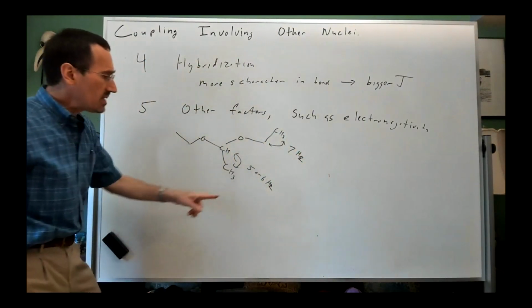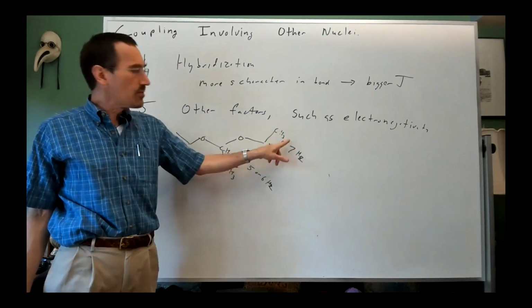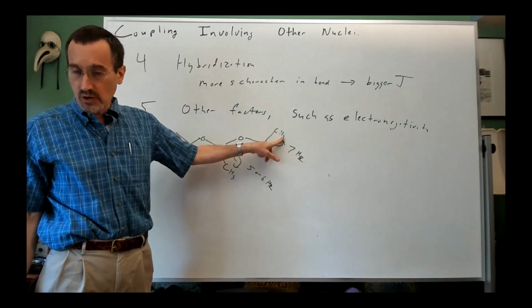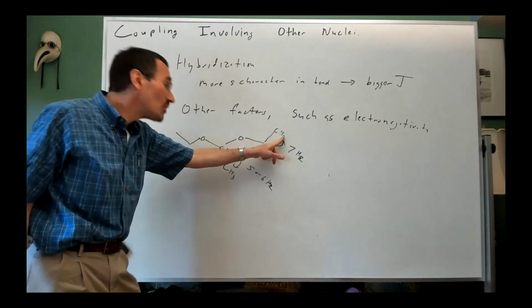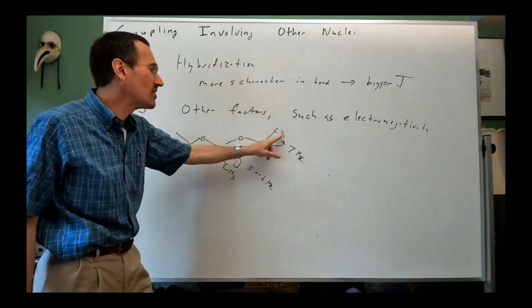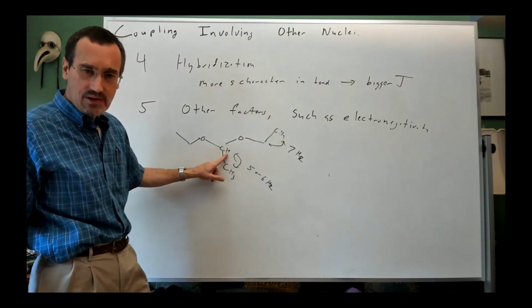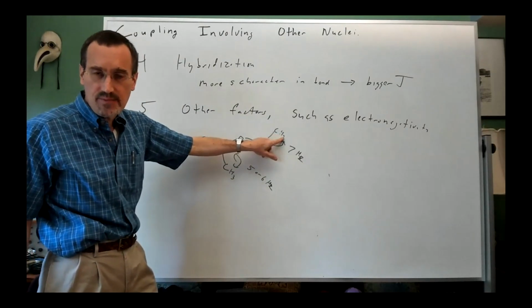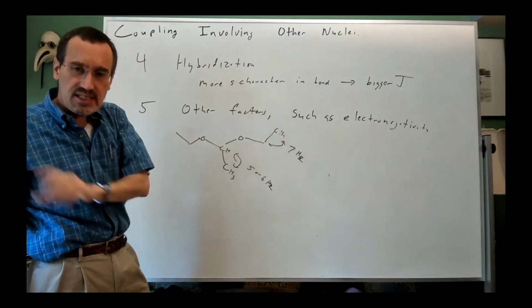And what you'll end up seeing, if you see this methyl as a triplet and you see this methine as a quartet, your eye calibrating on the line spacing of this methyl says, oh, this is about the distance that 7 hertz is.